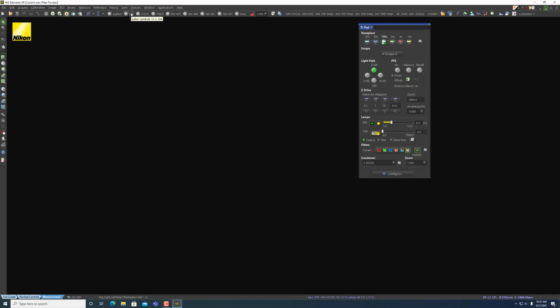And then there's another shutter in order to actually see the bright field, and you'll have to press that here. So all 3 of these will need to be open, along with this being on E100. It can be L100 actually, but these 3 will all need to be turned on in order for you to see the bright field. But as I said, I'm not using bright field today. I'm just going to turn all this off and move on to the next thing.